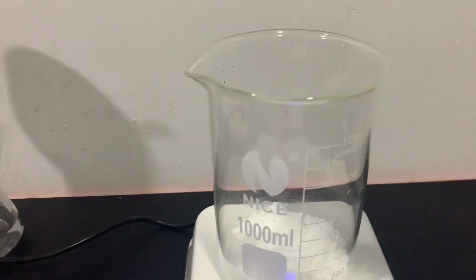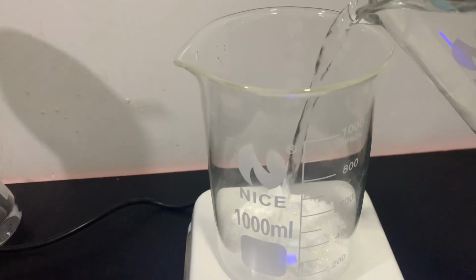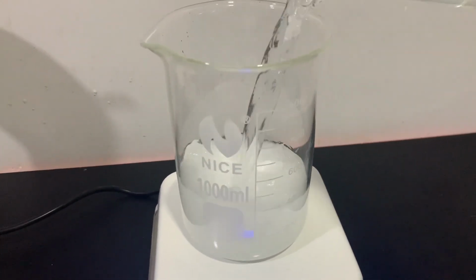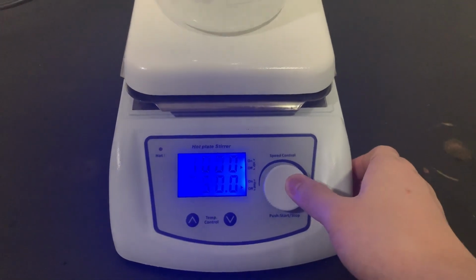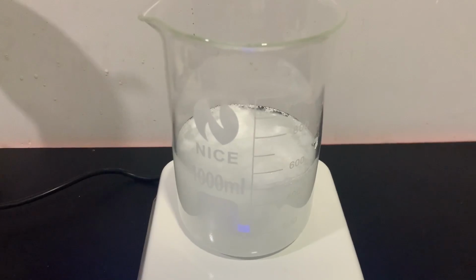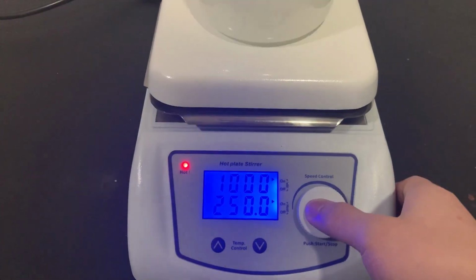The phthalimide is still mixed in with unreacted urea and phthalic anhydride, so I cleaned it up by adding it to a beaker. And then I added in 500 milliliters of water. I turned on the heat and boiled the water for around 15 minutes. After 15 minutes, I turned off the heat from the hot plate.